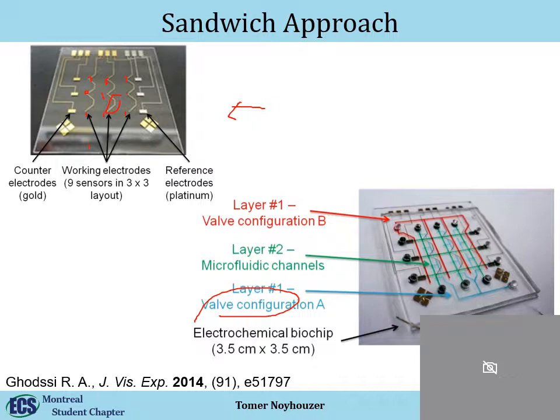The second layer, so we have this layer of the electrode. The second layer will actually be the channels. So you have a layer that is actually open, but it will define the channels, but it will be open in places like where you have your sensors. So let's say we have 3 sensors, right? So it's opened in this place. So by sandwiching it, we're actually having our connections to the electrode in these holes, right? But this layer might be open on the top.